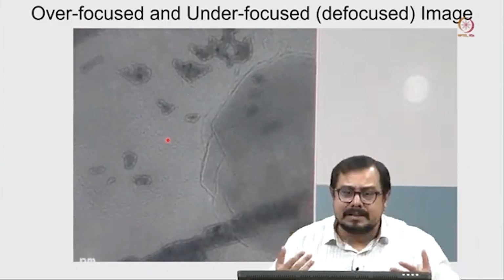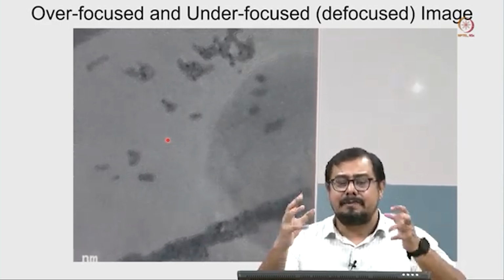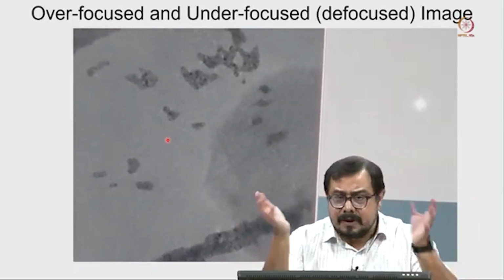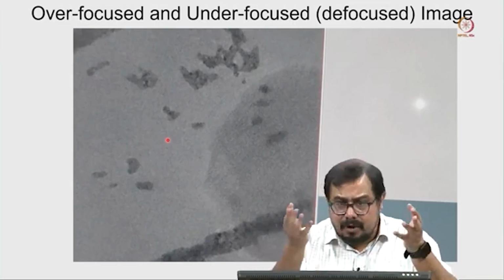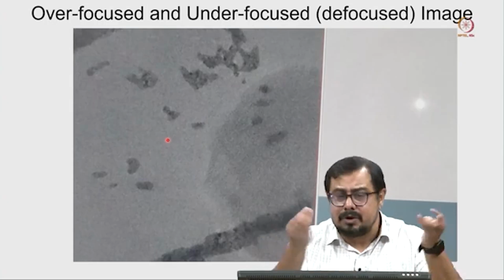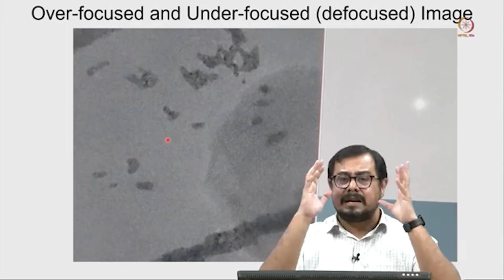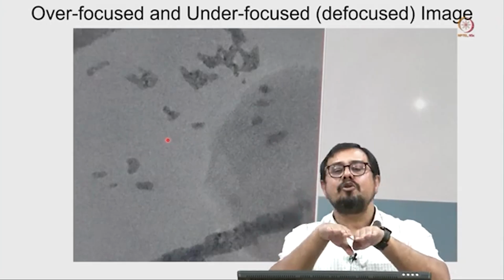And for the biological science sample, it is very important, because most of the time a biological sample will stay inside a buffer solution, which is either phosphate buffer or Tris buffer or HEPES buffer. Now, the components of those are very similar to the components of protein, DNA or RNA: carbon, hydrogen, nitrogen, oxygen, at most sulfur, phosphate and some metal ions. You can see it is not that heavy a group, and that is the reason the scattering will be so low.